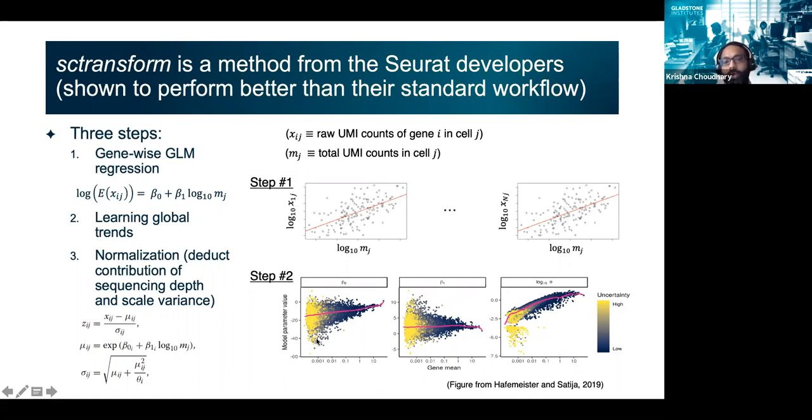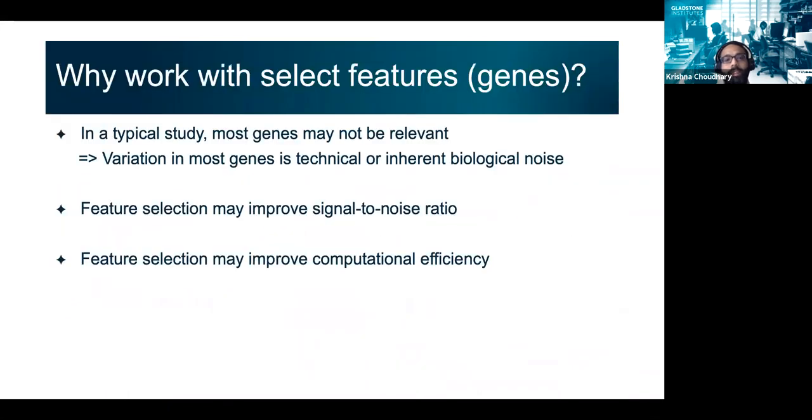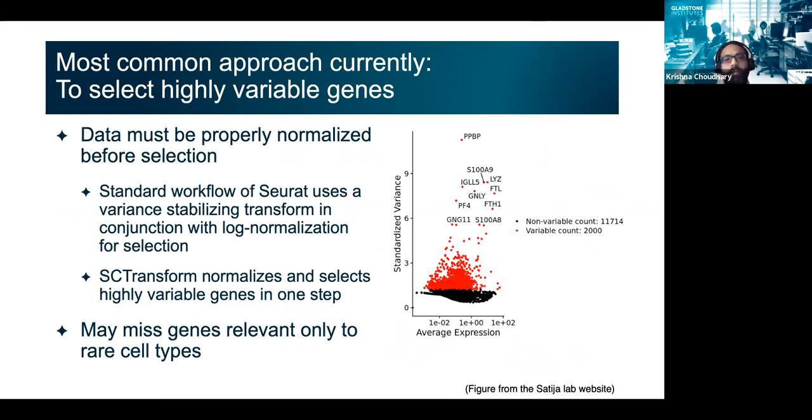And that prediction is based on, again, a curve fitting kind of approach where you have, for each gene, its mean value, the mean log normalized UMI counts, and also its variance. You look at that for each of the genes in the population, and then you fit a trend line. And then the trend line is the prediction for each gene's variance. So the standardized variance for log normalization works in a similar fashion, but again, there are differences because of the way data is normalized.